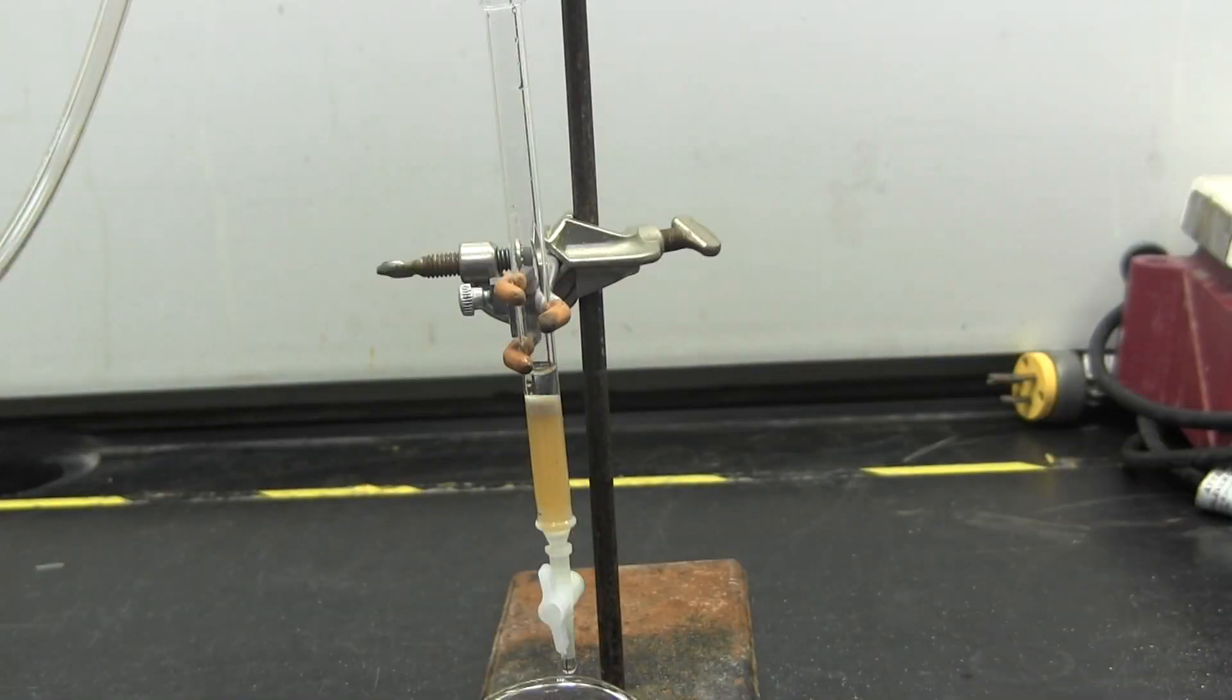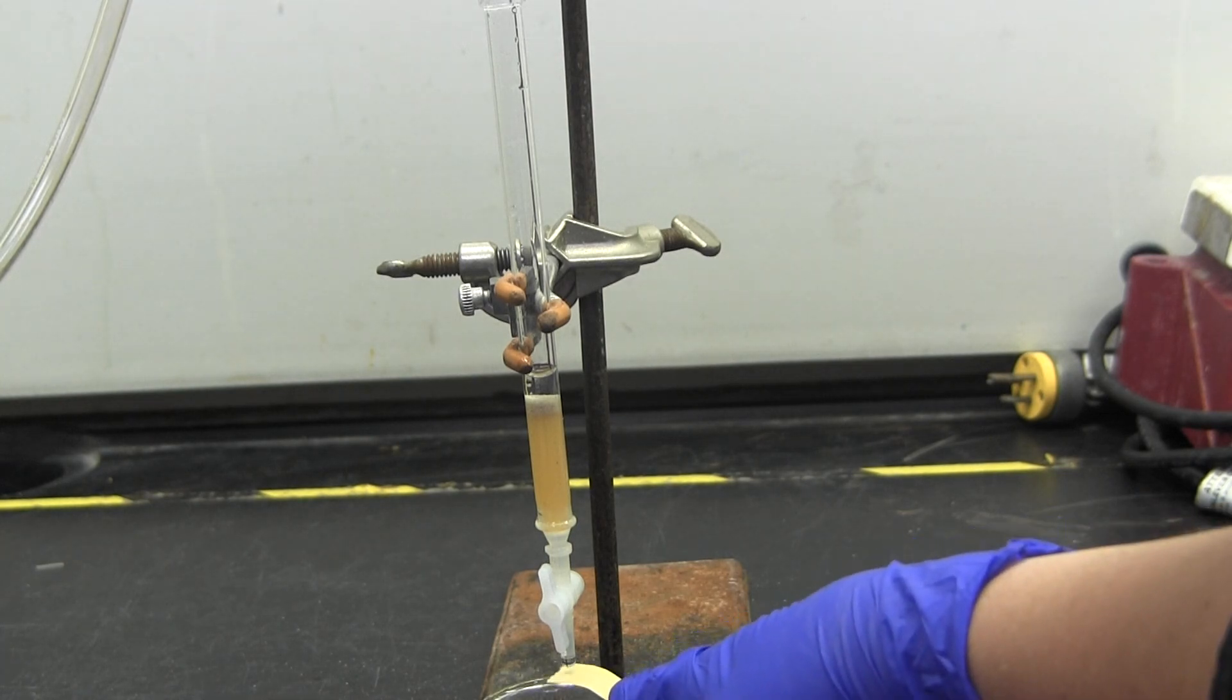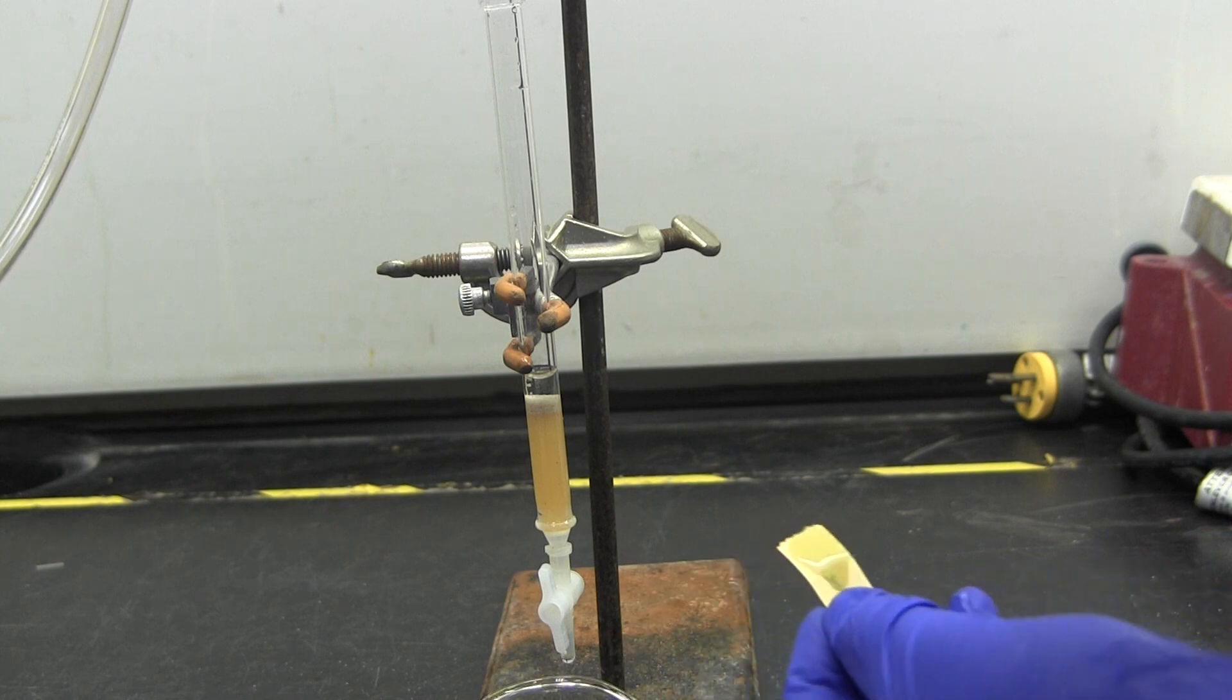Then fill the column with water. You may use the open Y-joint to add liquids, but not solids. Use nitrogen again and push the water carefully through the column. You will run water through the column twice.